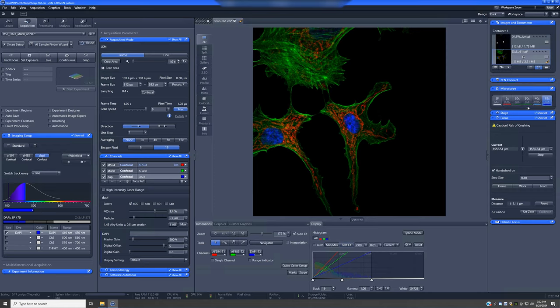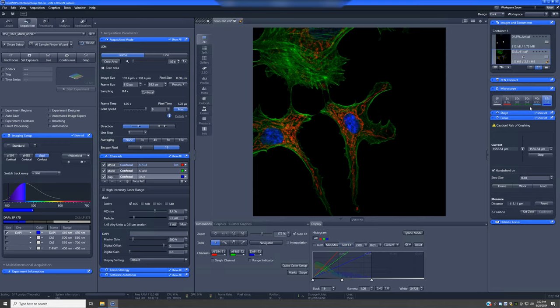The 20x0.4 is a specialized objective that is compatible with plastic multi-well plates. If you use plastic multi-well plates, you should use this objective and only this objective aside from the 5x, which I'll discuss in a second. It also is compatible with something called Plast DIC, which is a form of contrast enhancement that is compatible with plastic and gives results similar to something called DIC. If you're trying to image things through plastic plates, this is a good option.